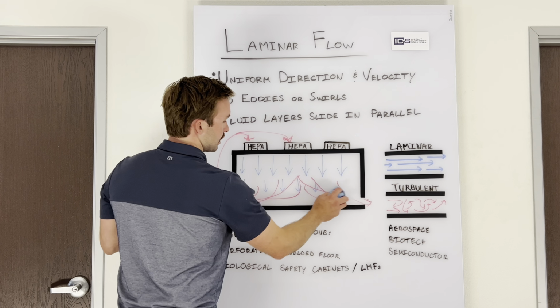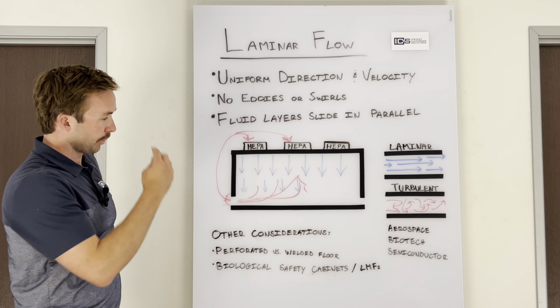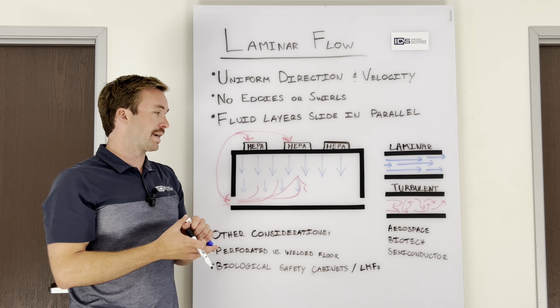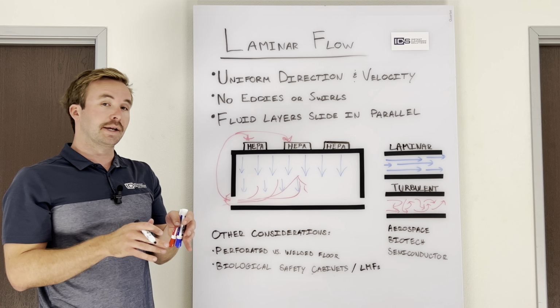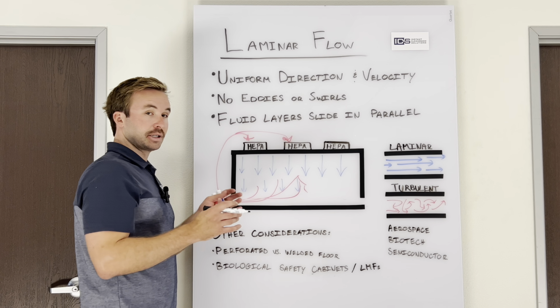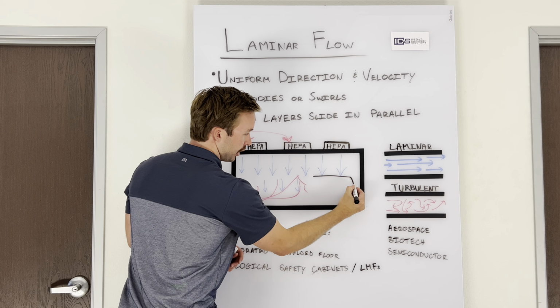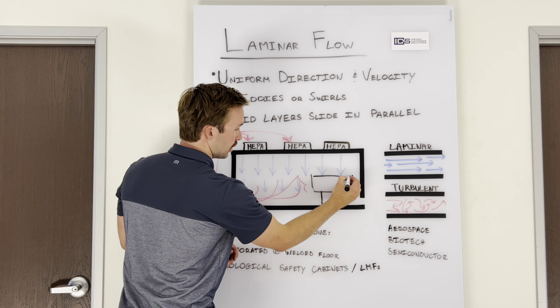These are great devices. Now let's just introduce one right over here. They serve a great purpose, and if maintained properly, properly installed and not damaged, they can provide very clean air, 99.995% efficient air at 0.3 microns over your workstation directly. And it's a lot less susceptible to airborne contamination because it's a dedicated small laminar flow workspace put inside of a larger clean environment. So let's just put a laminar flow hood right here.